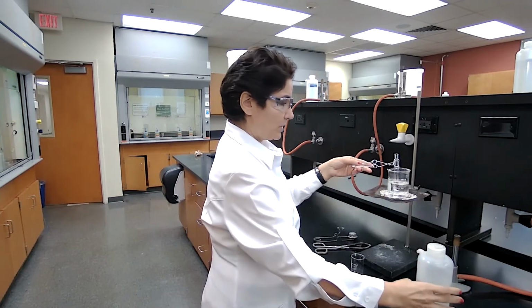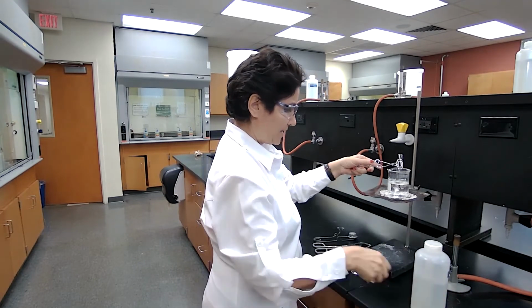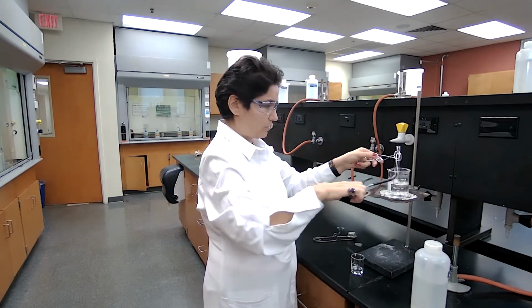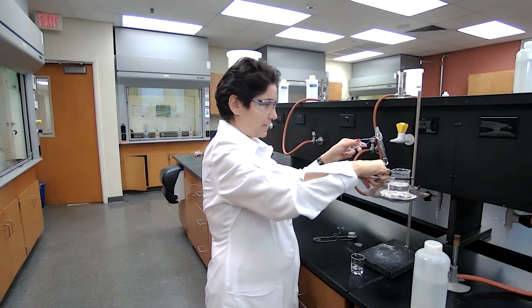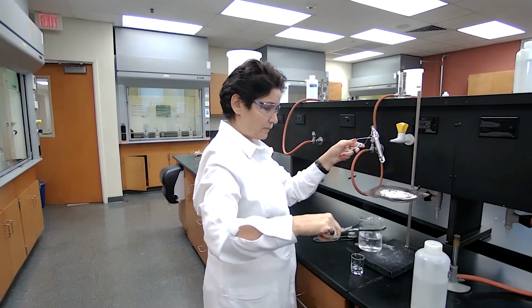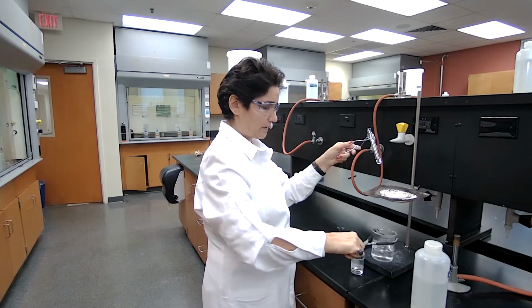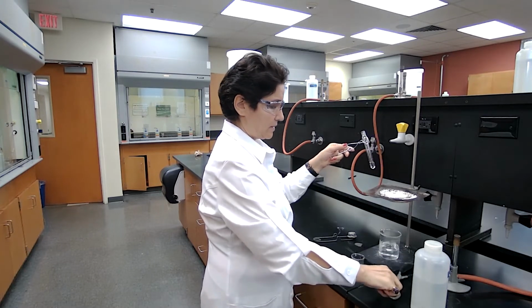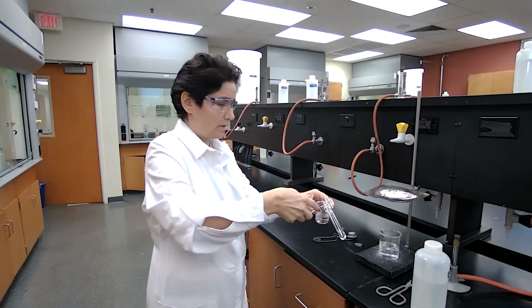I'm going to add some warm water. So basically I'm adding some hot water and cold water to that beaker, small beaker. So I use a beaker holder, transfer some of the hot water into the small beaker, and pour the mixture into the warm water.